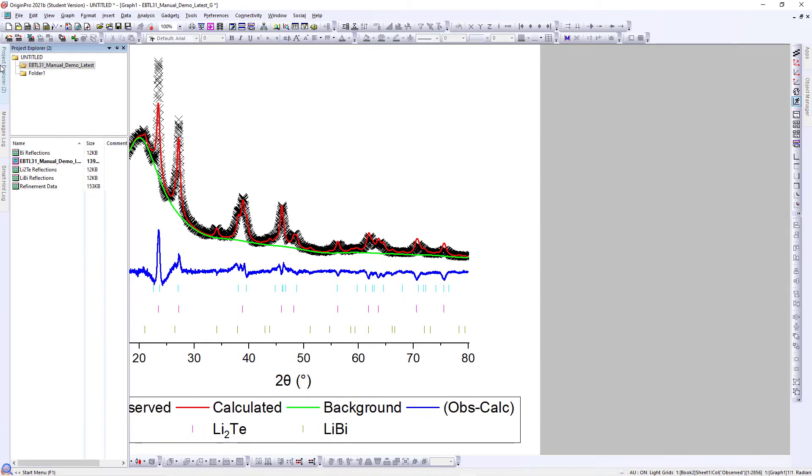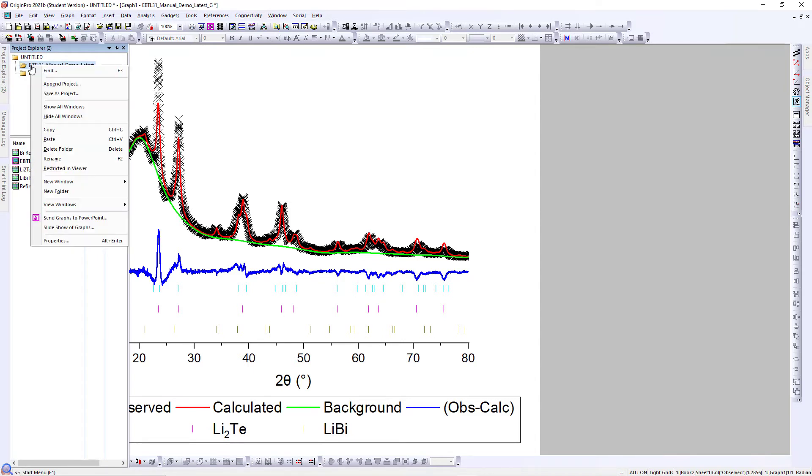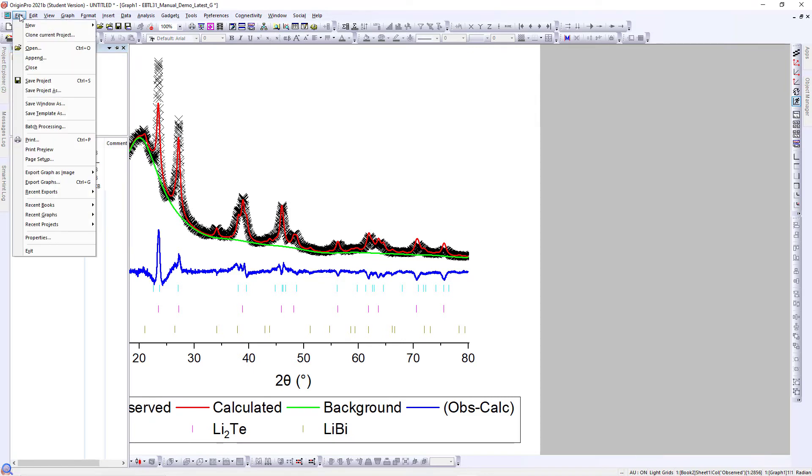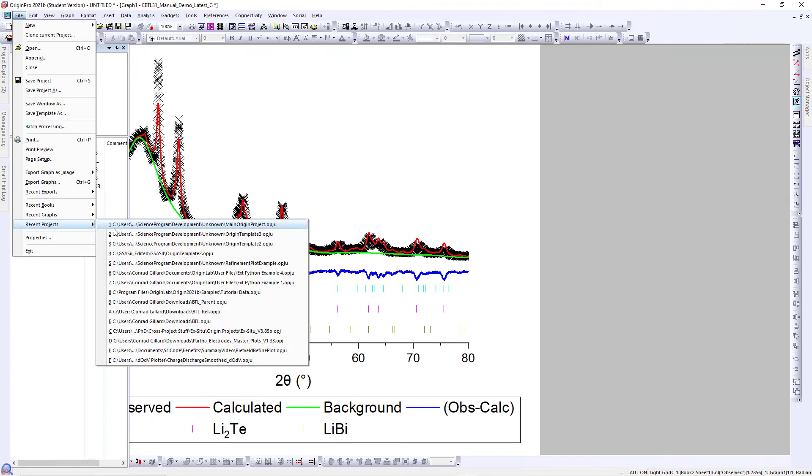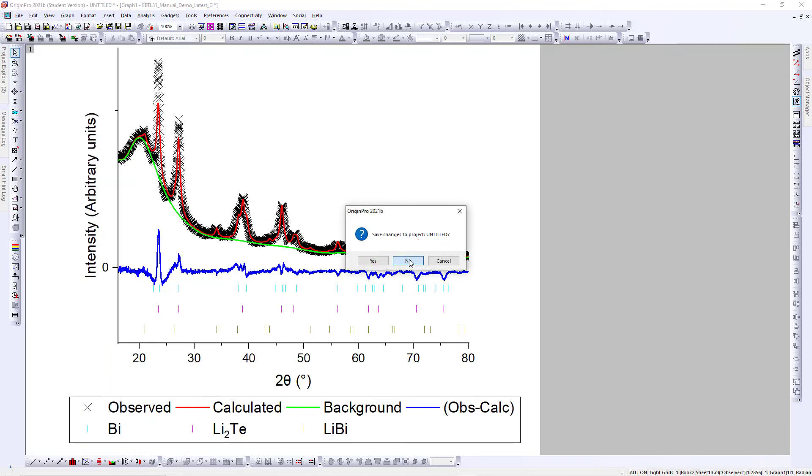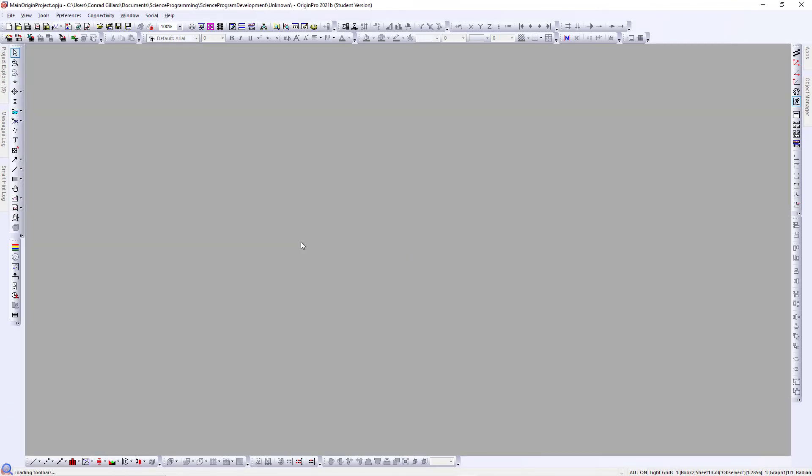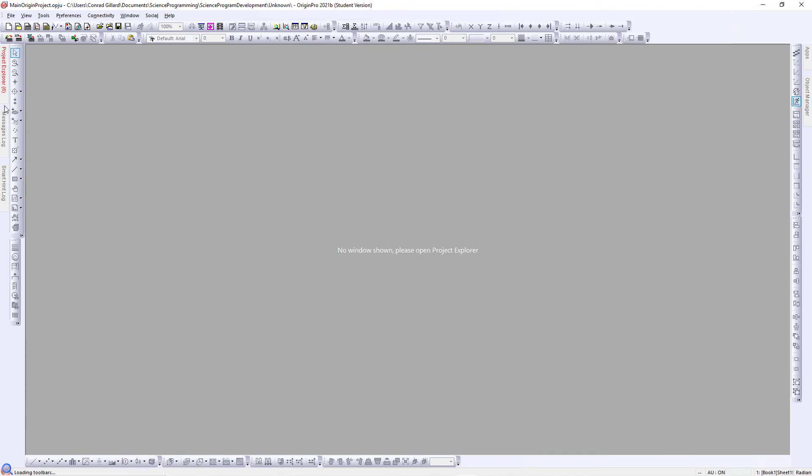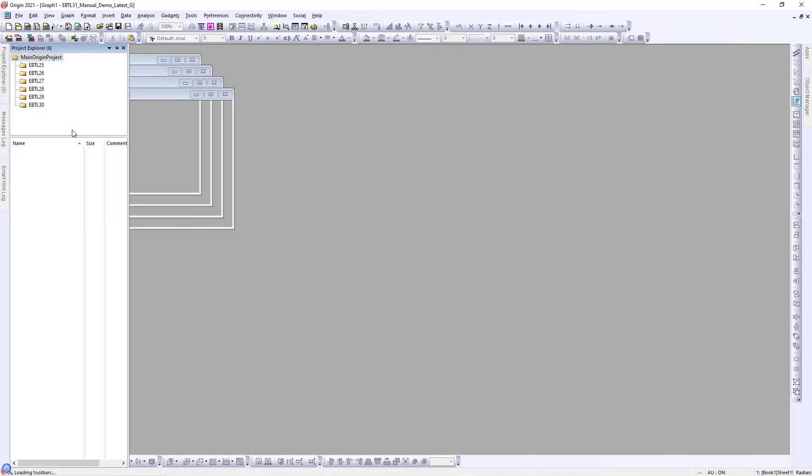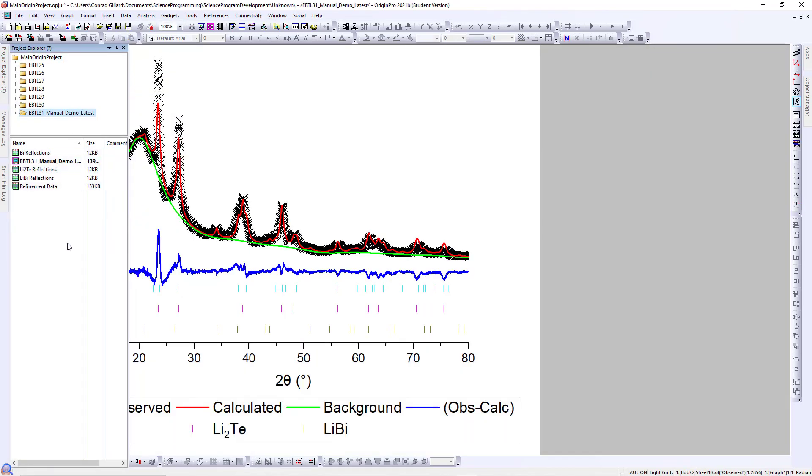It should be noted that the program develops the plot in a new Origin project. To transfer this to a different Origin project, simply copy the folder containing the plot, open the new project, and right-click Paste into the desired location.